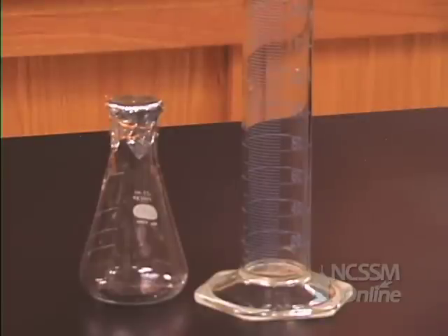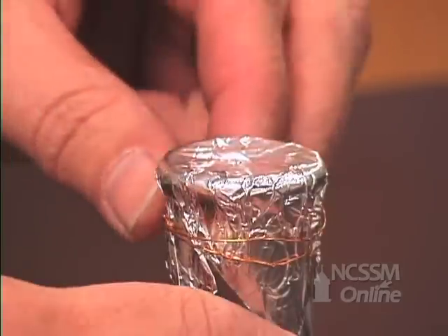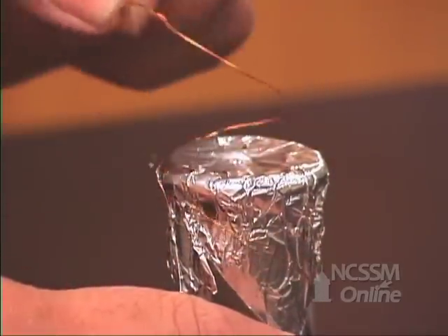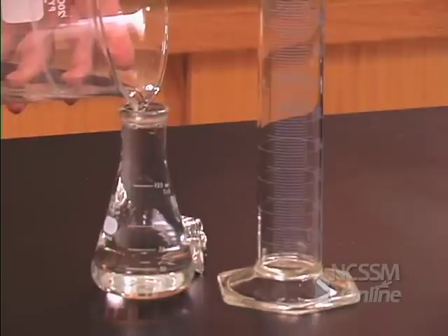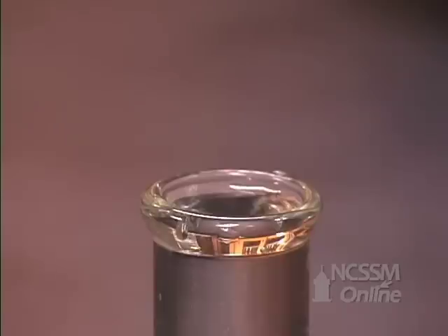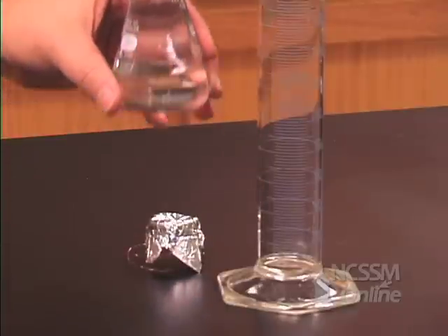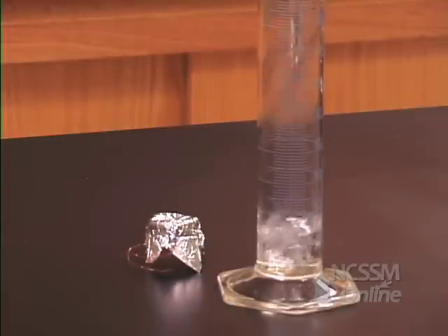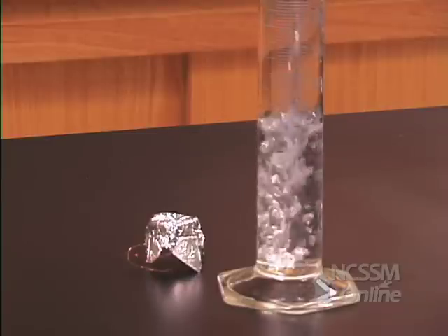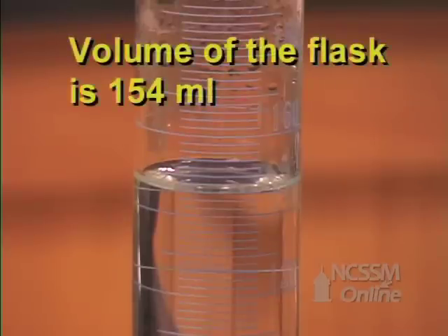We will determine the volume of the flask, which is also the volume which the vapor occupied at the temperature of the boiling water bath. We will remove the copper wire and the aluminum foil. We will fill the flask completely with water, and we will pour the water into a graduated cylinder. We will record the volume of the water.